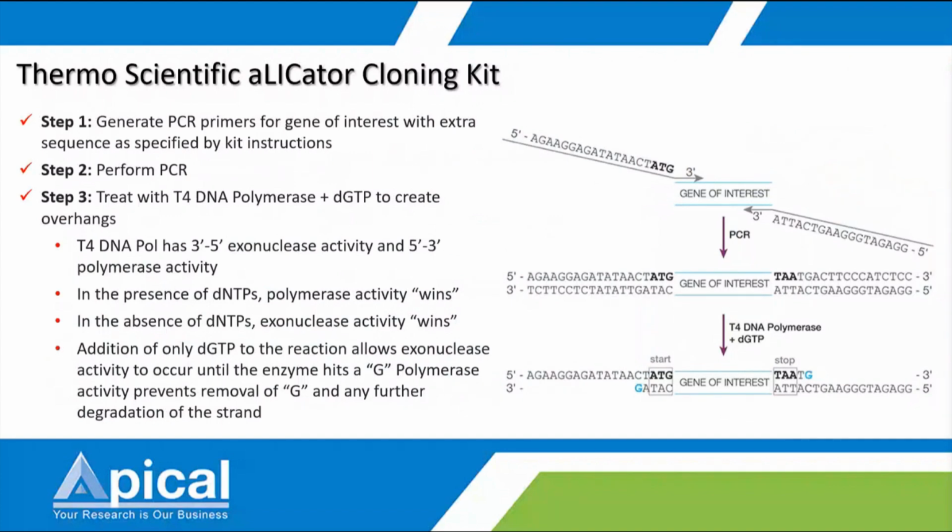So how this LIC system works is, first, you need to create the PCR product with a complementary overhang.